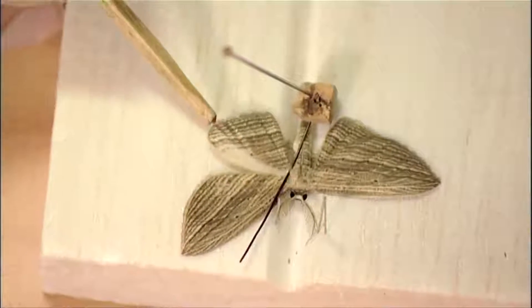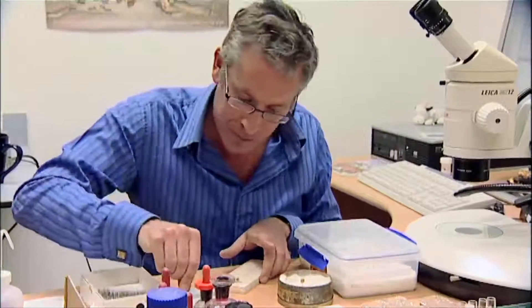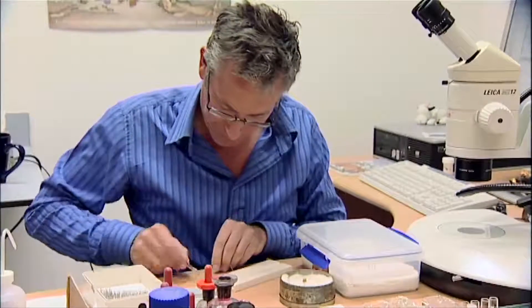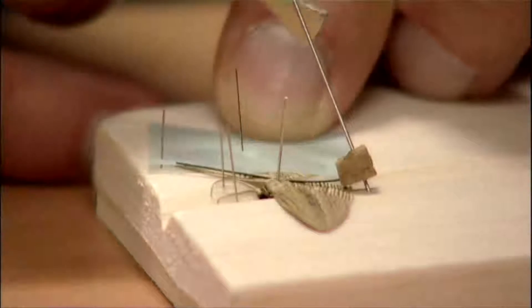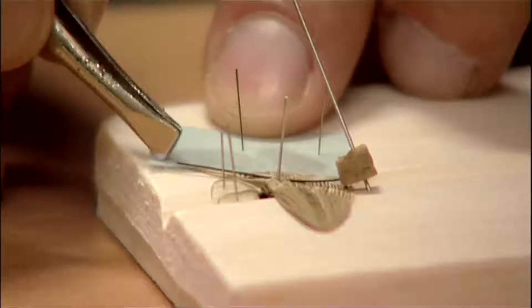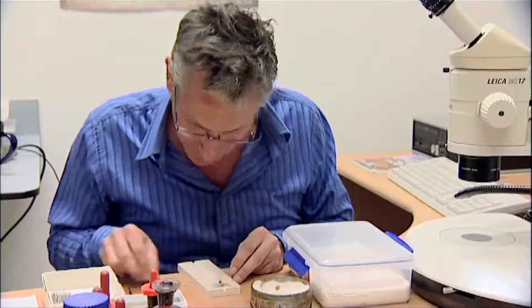Then I do the same with the hind wing, bringing it up just underneath the forewing. Then you just pin your little bit of tracing paper over the wings with little pins so that it's holding the wing in place. And once the wing is held in place with the paper, you can take the setting bristle away.